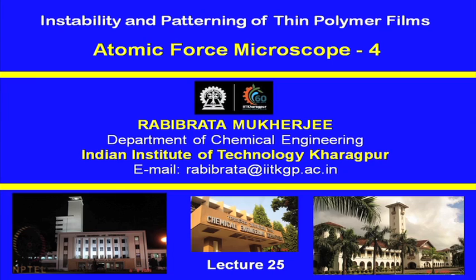Welcome back. We will now continue our discussion on atomic force microscope, and we will discuss how the images actually get generated. So, we are building our fundamentals step by step. First, we discussed what are the hardware elements, what are the key operational aspects, and then we got into some bit of details, and in the previous class, if you remember, we discussed the sequence of approach. So, now we have an atomic force microscope which has sort of approached, and therefore, the piezo is now active, and so is the feedback loop.